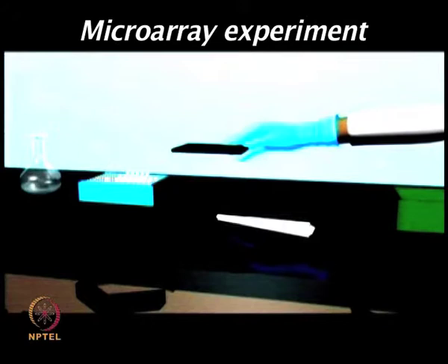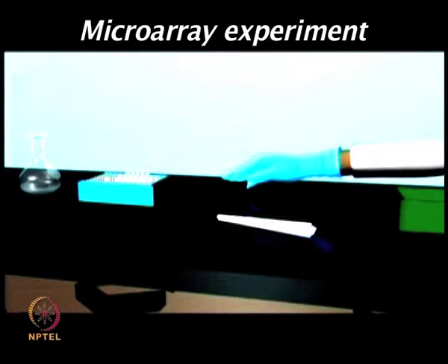You need to place the cover slip to avoid any dust or any other particles on the chip surface.